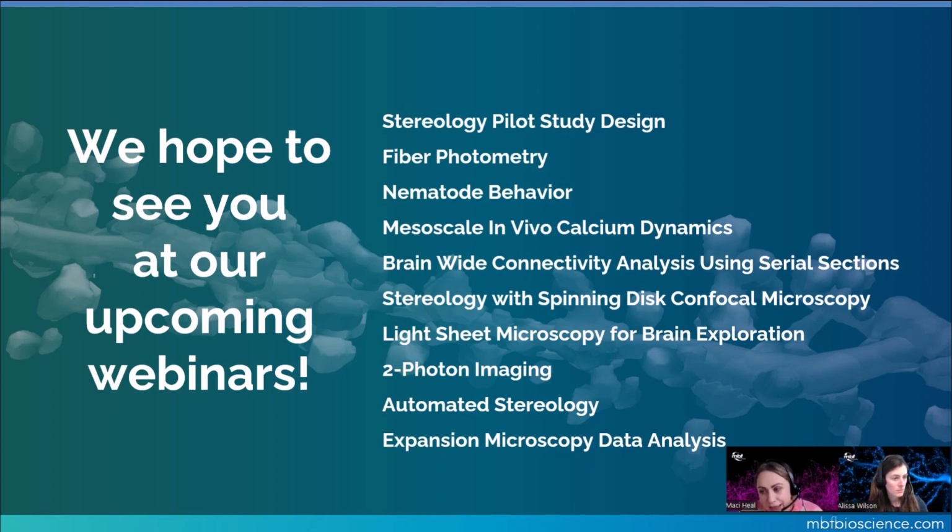That tool specifically has a feature to detect based on proximity. So you can detect puncta in one channel by proximity to vessels in another channel, or to a cell body. So you can look at intracellular proteins, or how synapses are forming and things like that. There's a lot of things you can do using a combination of those tools to answer those questions.